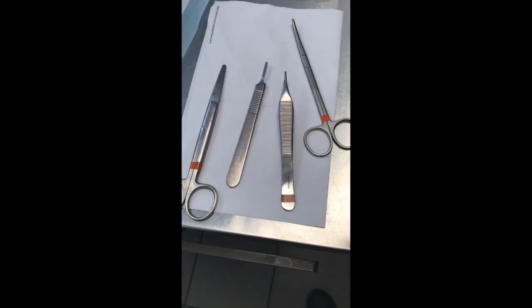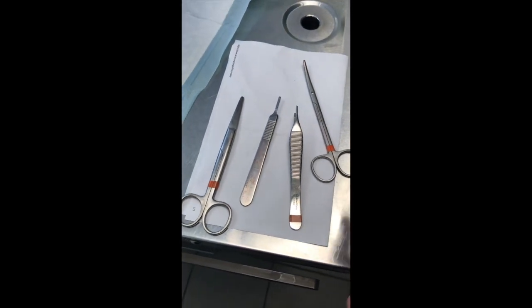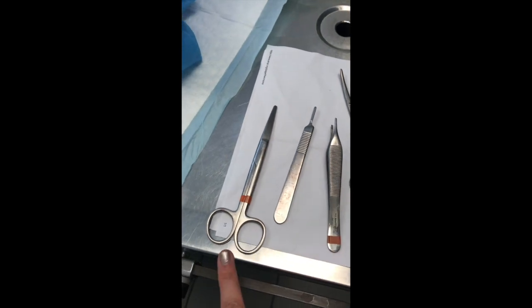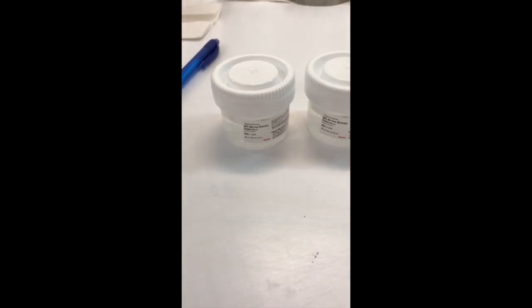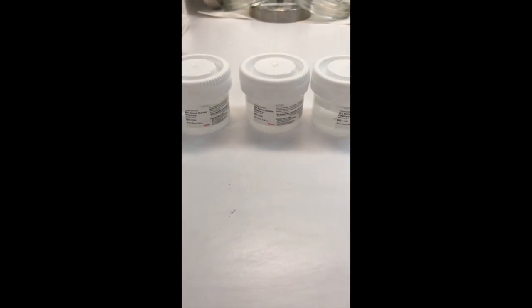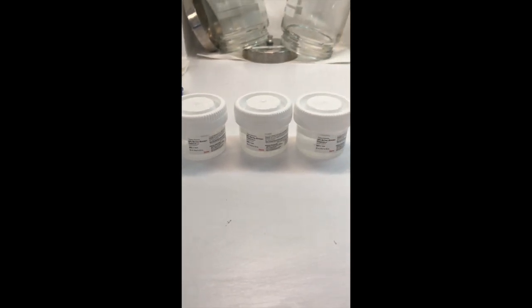These are the instruments that we'll be using today for our necropsy. We have our Metzenbaum scissors, our forceps, our scalpel blade holder, and our OR scissors. These are our formalin jars that we're going to put any internal organs in that we wish to send out to the lab to have them tested.